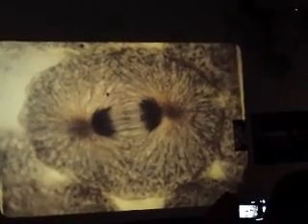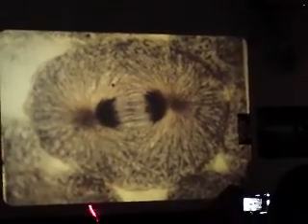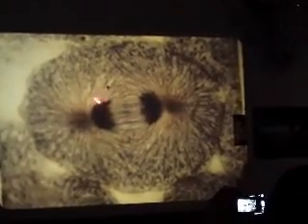What phase? Anaphase. No furrow cleavage yet, so anaphase. And what's this thing right here? Aster. What's that little tiny thing in the center? Centriole. And what's this stuff? Spindle. And what are these black things? Chromosomes. What's all this stuff? Cytoplasm.